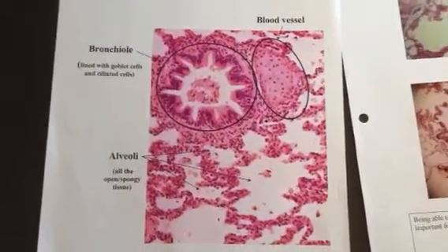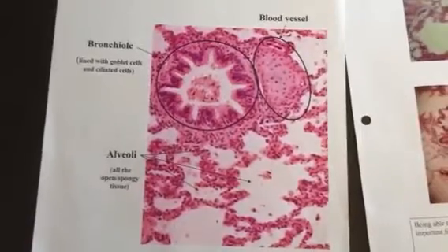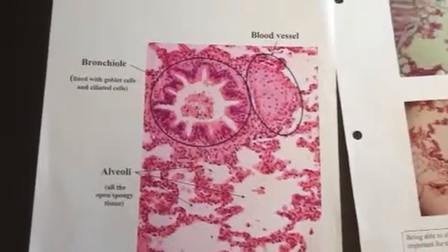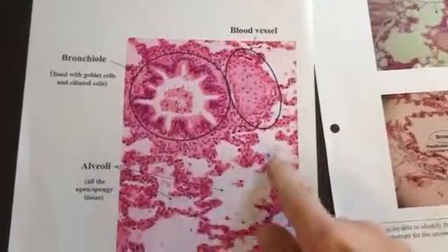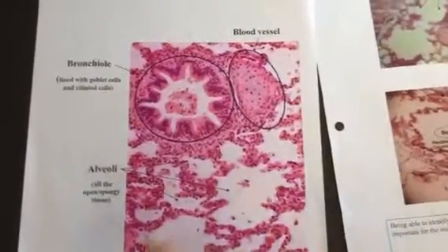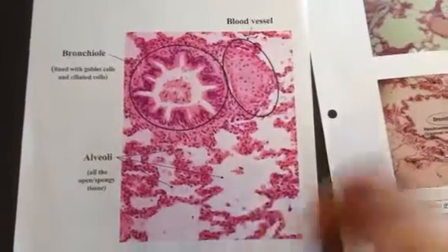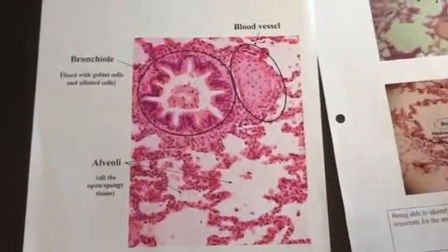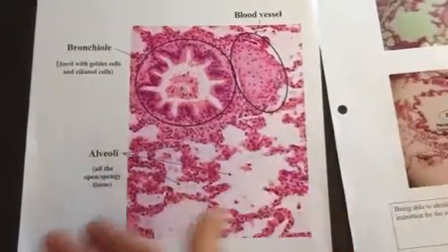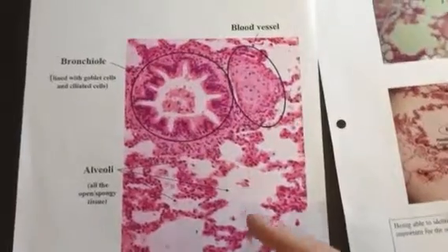Quick look here at the slides that you'll be looking at for tissues. This is lung tissue. These are very important because we almost always put them on an exam. What you're seeing down here, this rough structure, is a transverse cut across the alveoli. So it doesn't look like little bags — it just looks like the membrane tissue that makes the bags cut across. It looks like a messy matrix of spongy stuff.